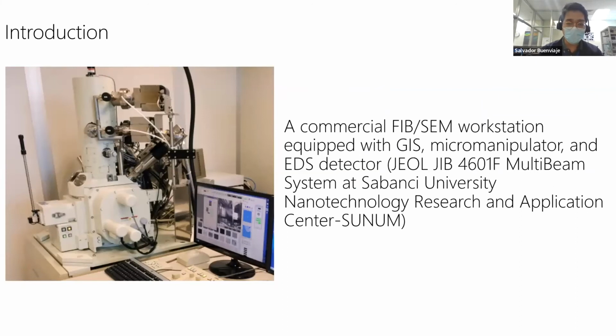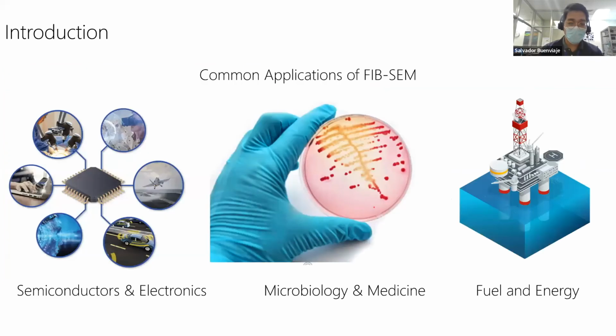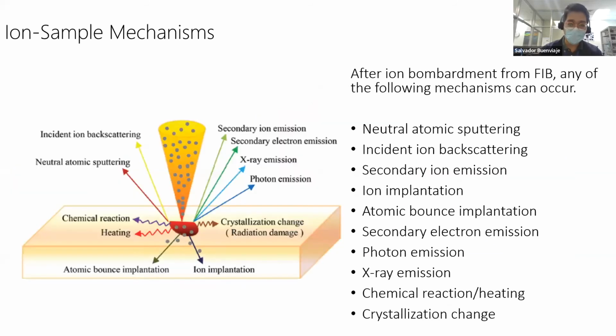So this is an example of a FIB-SEM workstation. So the coupled FIB-SEM characterization. So common applications of FIB-SEM: semiconductors, electronics. It is also used in microbiology, medicine, fuel, and energy.